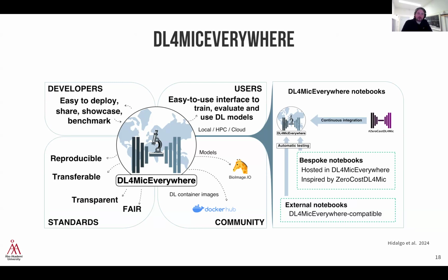we further developed the platform into something now called DL4MicEverywhere, where we are now using containers in order to package each of the notebooks that we've previously developed. If you're not familiar with Docker containers, basically they are mini Python ecosystems that are self-contained, containing the correct libraries and dependencies to run specific tools, and then you can deploy them fairly easily in different places, whether it's using your own resources or on a server or whatever you have access to.